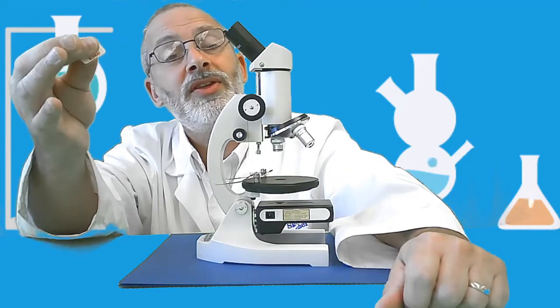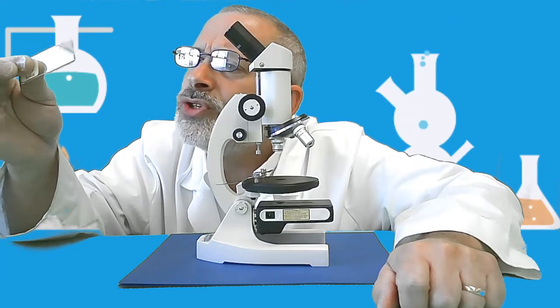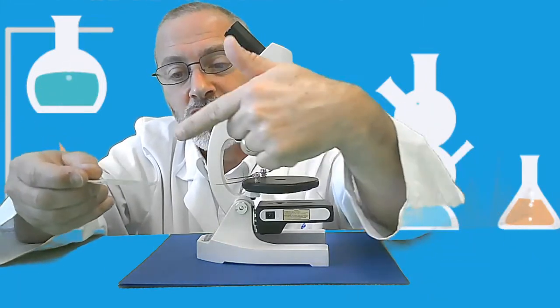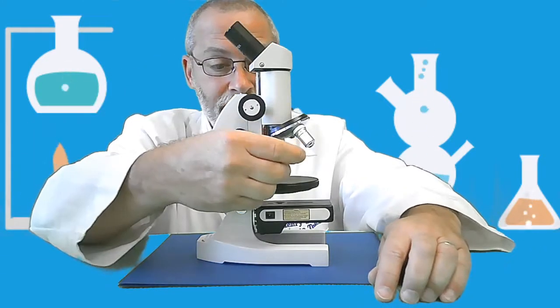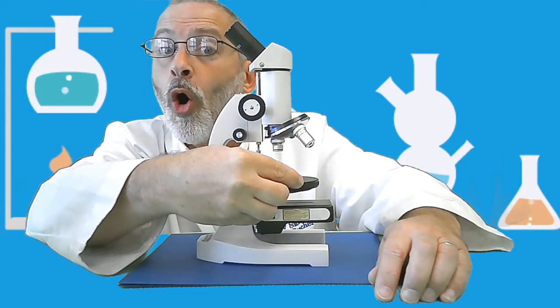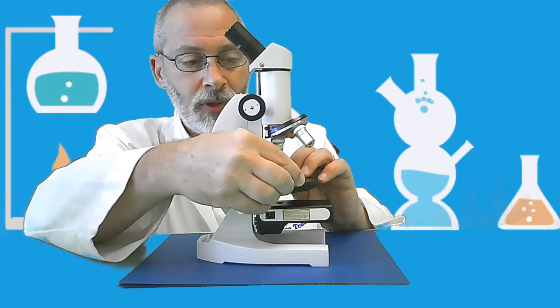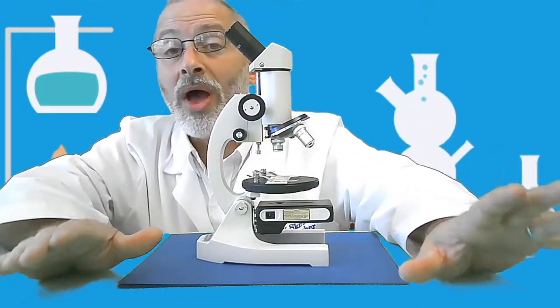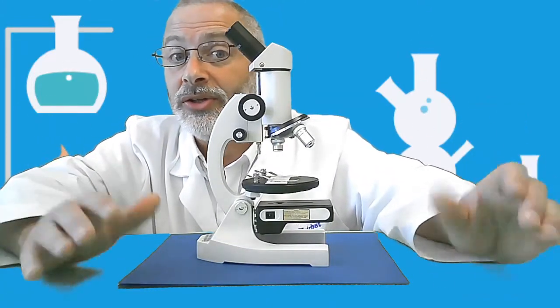Once you've obtained the slide, you examine it first with your eye. Oftentimes you will be able to see a specimen under the cover slip of the slide. And ideally what you need to do is place that specimen in the center of the diaphragm, the opening of the stage. Once you've positioned it in the center, you can actually use the stage clips to position it in a way that it won't slide around the stage. Now it is held into position.